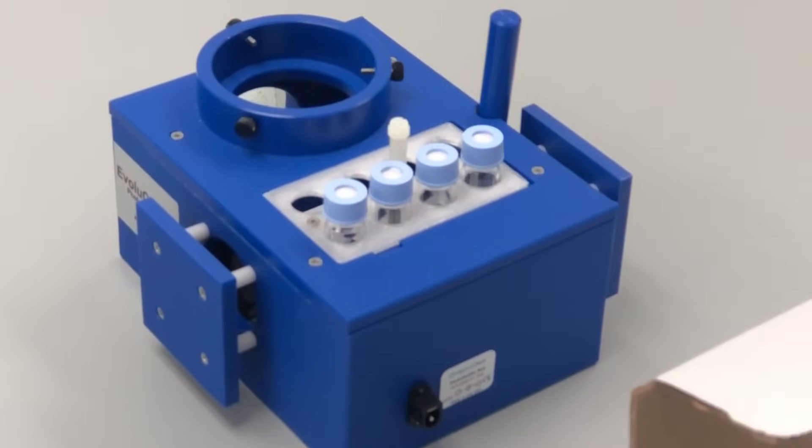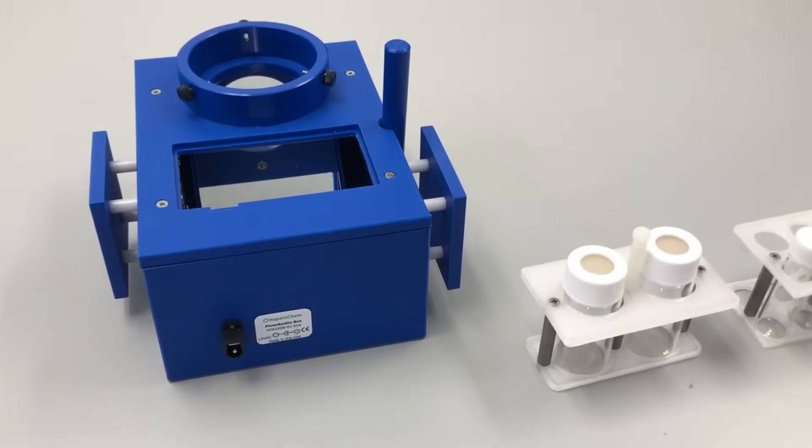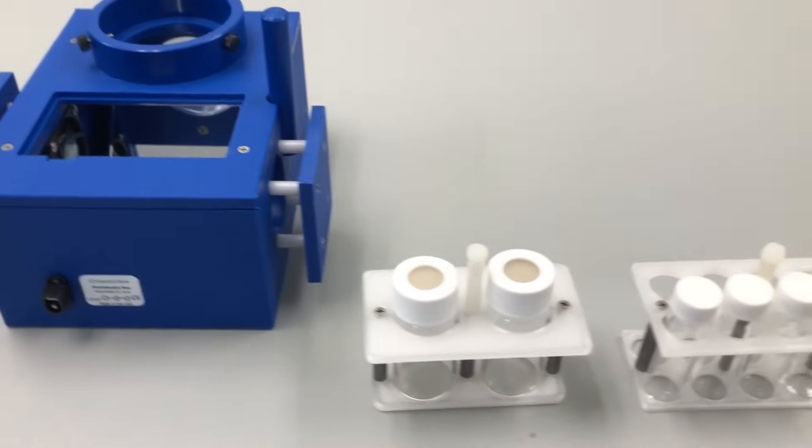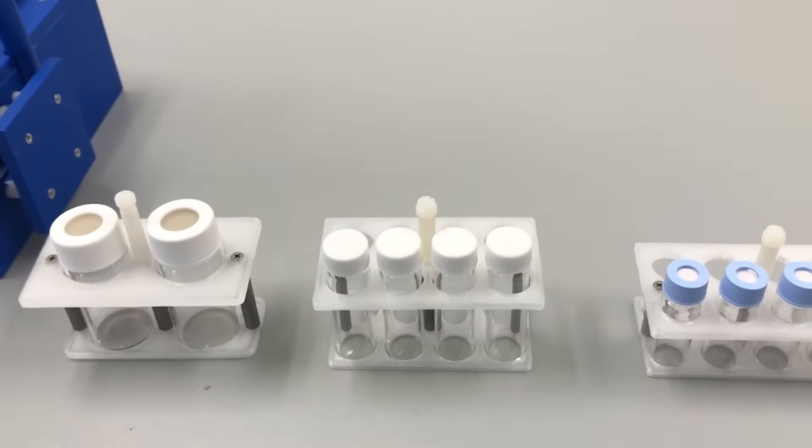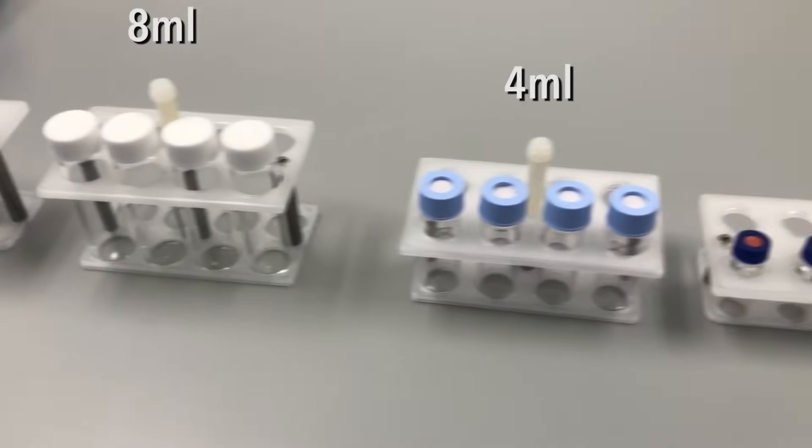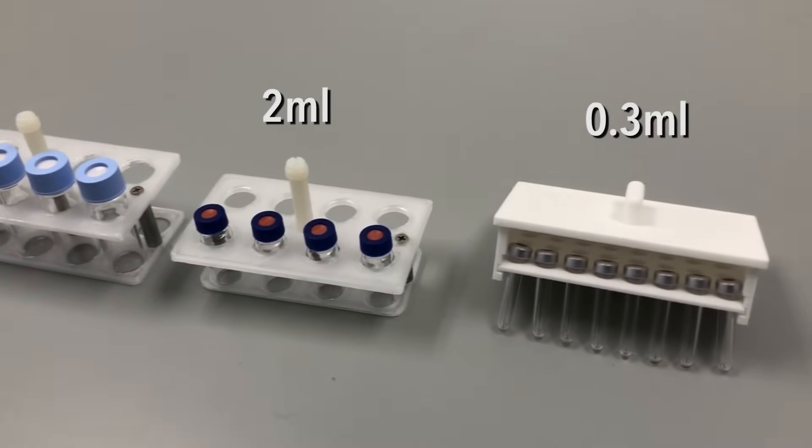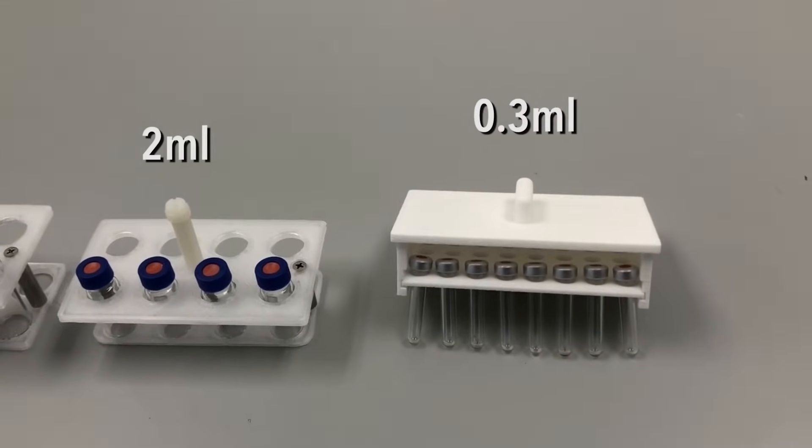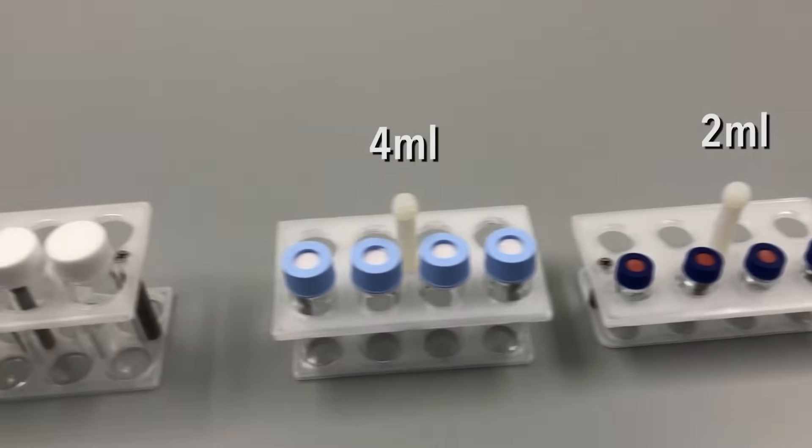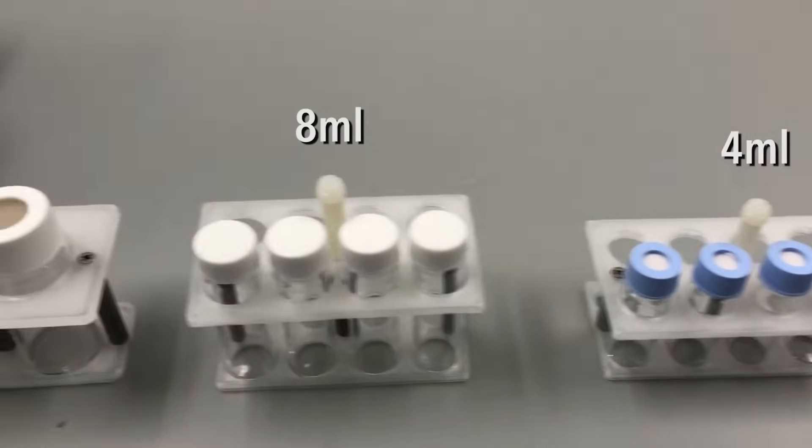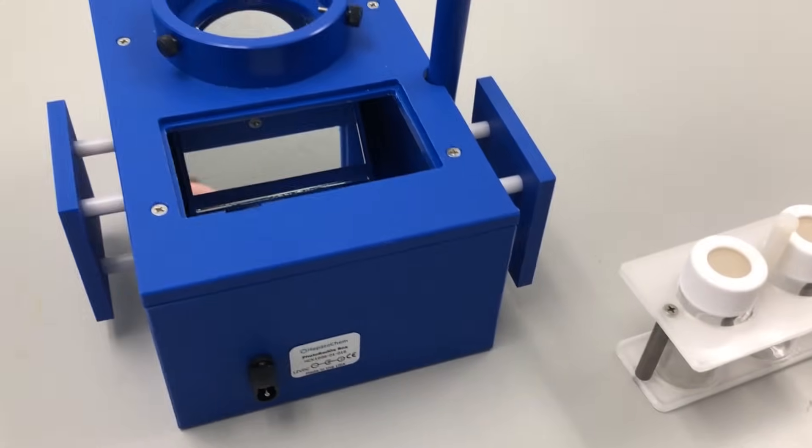Our vial holders come in the following options. A 20 milliliter holder which carries two vials. Our 8 milliliter, 4 milliliter, and 2 milliliter holders which are all designed for 8 total vials, and our 0.3 milliliter vial holder which can accommodate up to 32 simultaneous reactions.